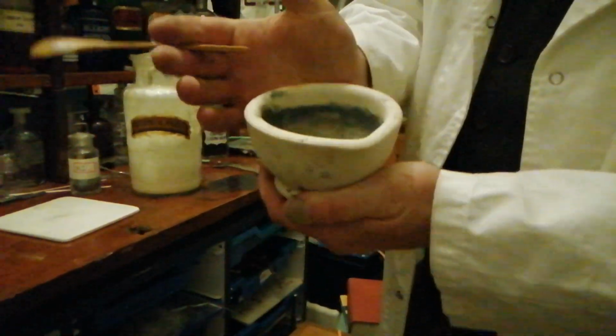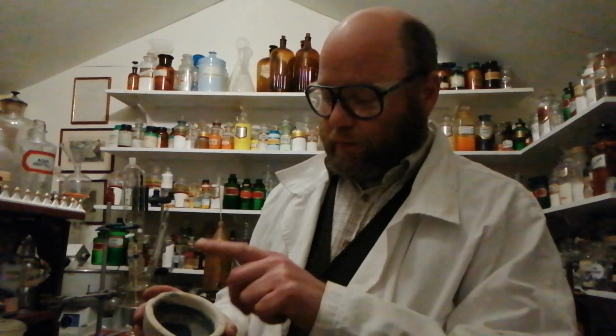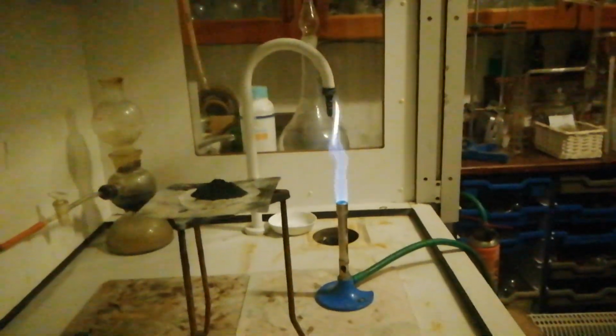So all we're going to do is replicate this experiment, which I think is one of the more memorable experiments I ever did at school, and that was to put it onto a wire gauze in the fume cupboard and heat it up with a Bunsen burner and stand back and watch and see what happens. So we're going to do that right now. So I'm just going to put this small amount of sulphur and zinc powder, turn up the gas, and heat it up and stand back and see what happens.